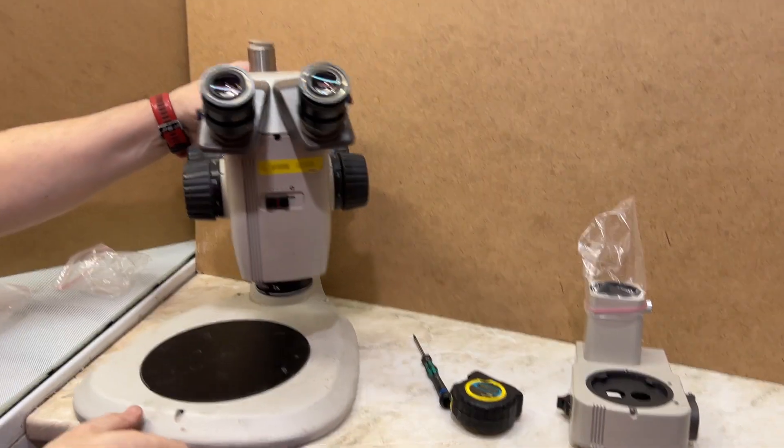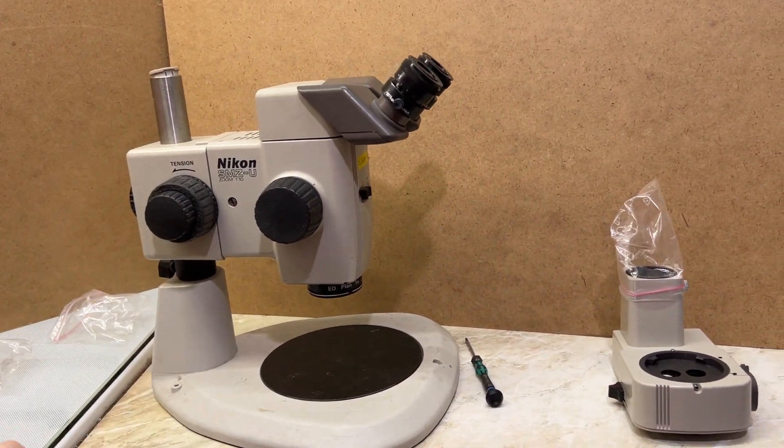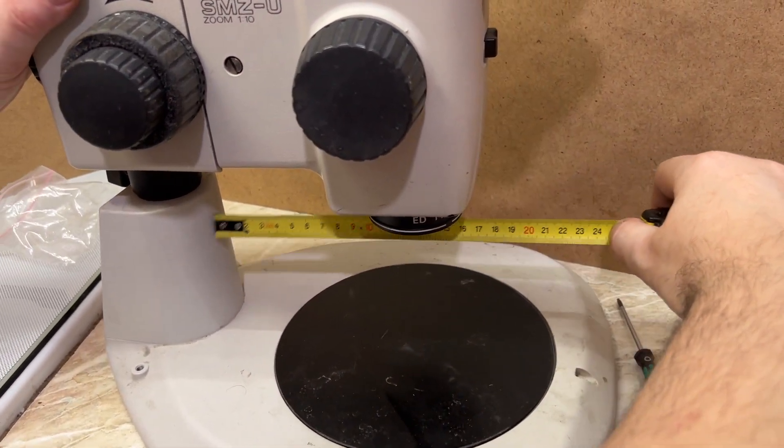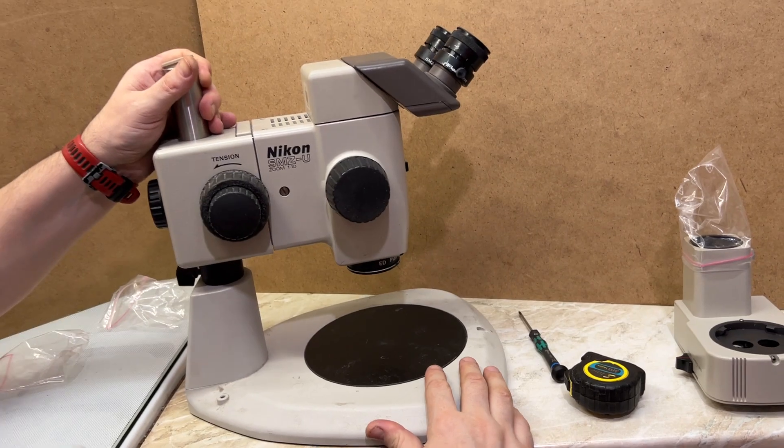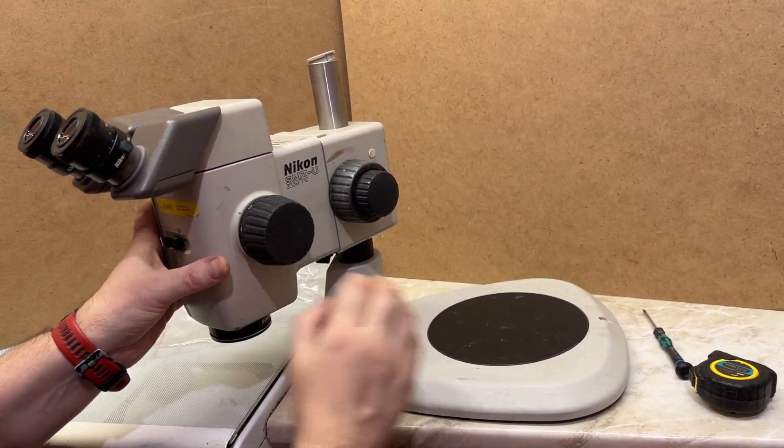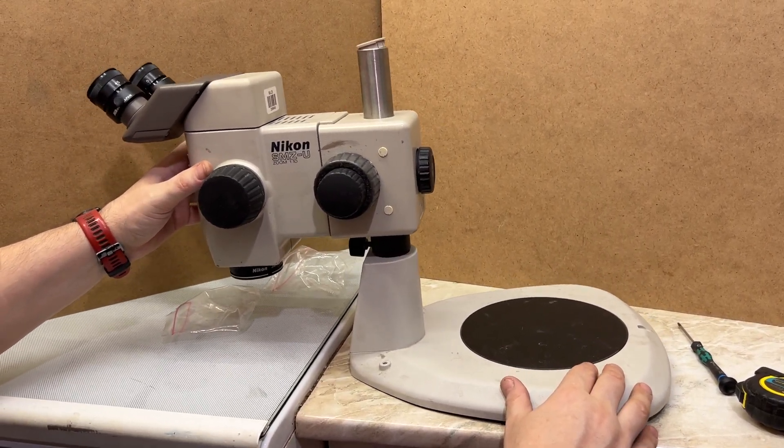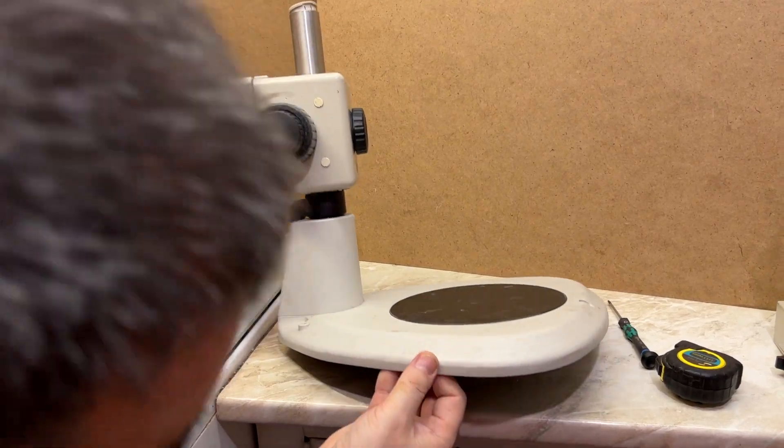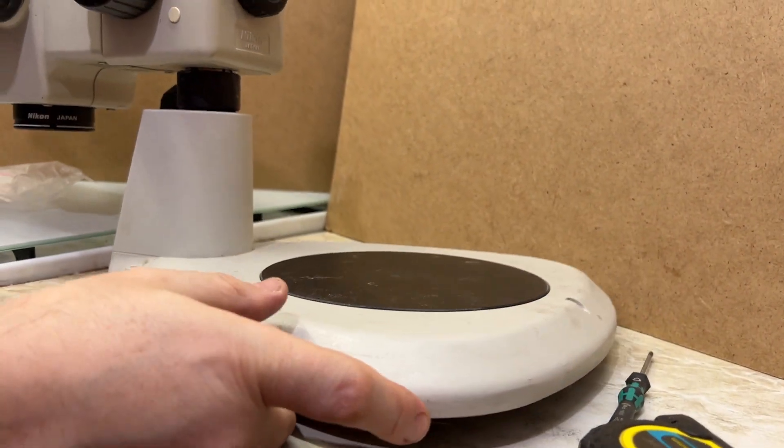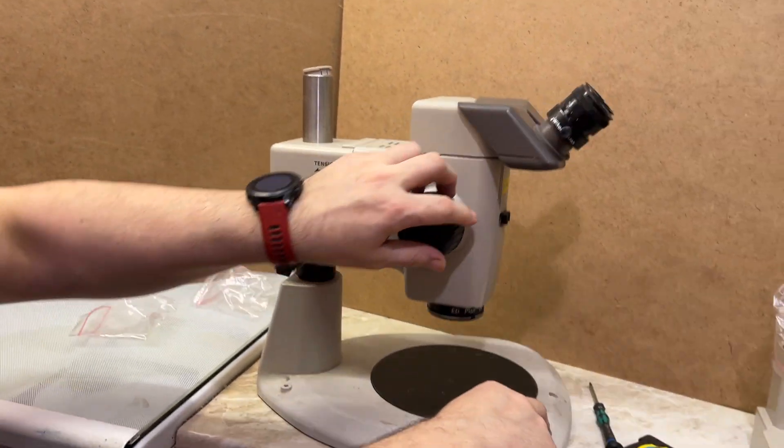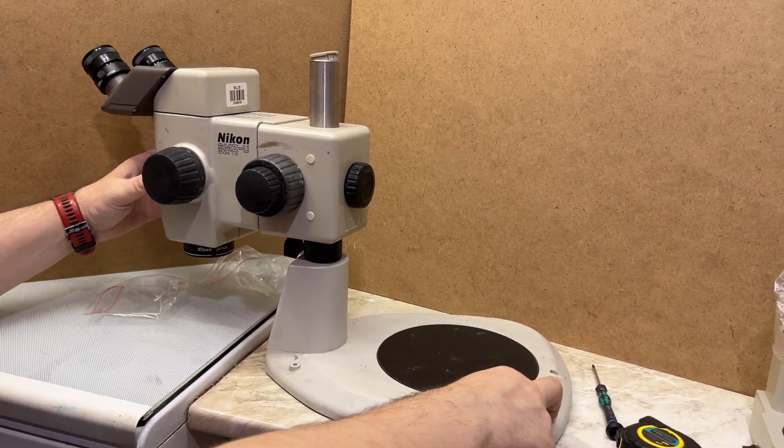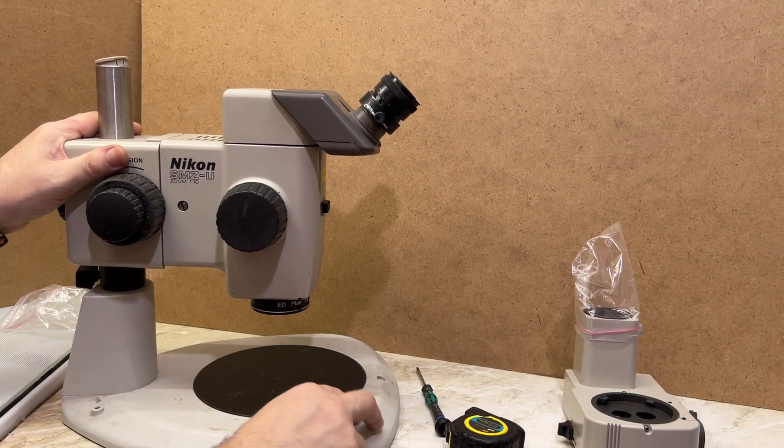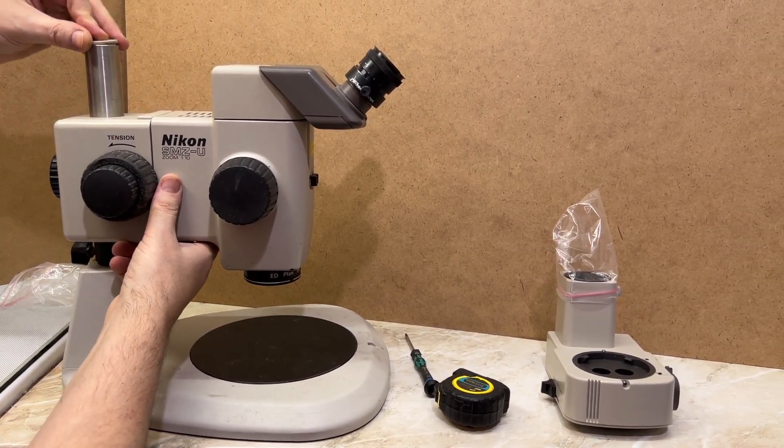When we use this stand, the distance from the limiter to the optical center is about 13 centimeters. With this stand we can rotate the microscope, but not that much because if you rotate to the back position it would tilt or even flip the stand. If we attach the stand to the table somehow, we can screw it to the table and have two work zones: one here and another there.